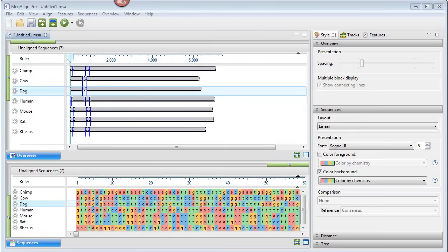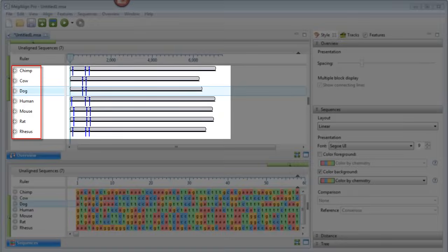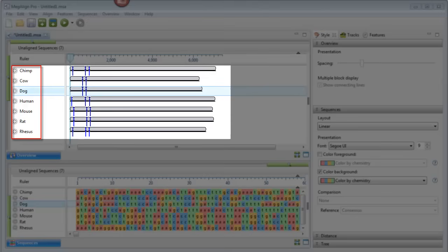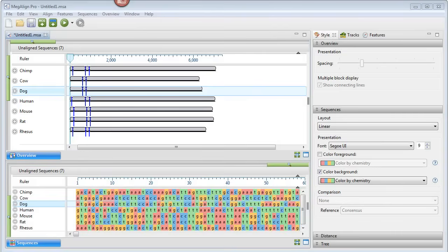By using this procedure several more times, I've created separate groups for the Cow, Dog, Human, Mouse, Rat, and Rhesus sequences. In each case, I replace the generic group name with the informal species name.